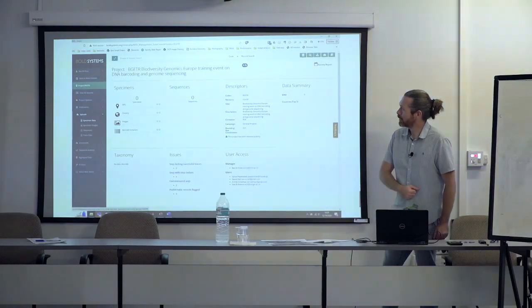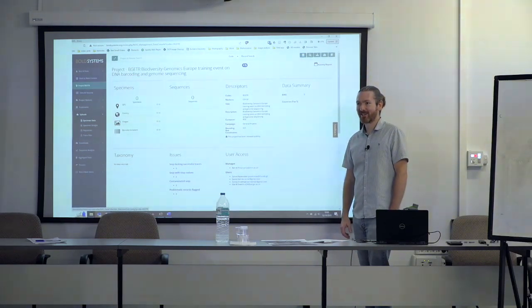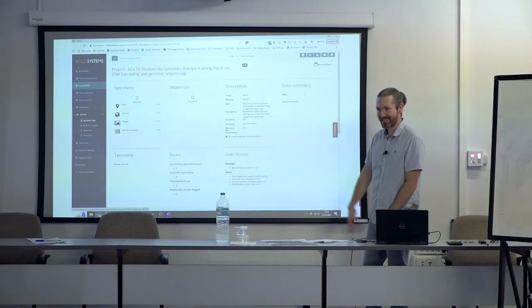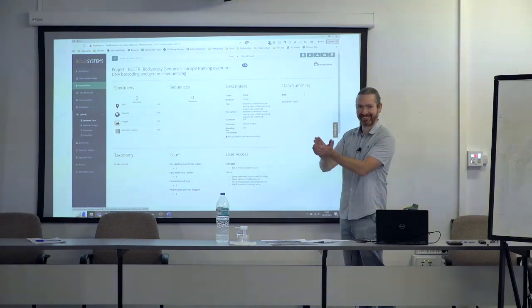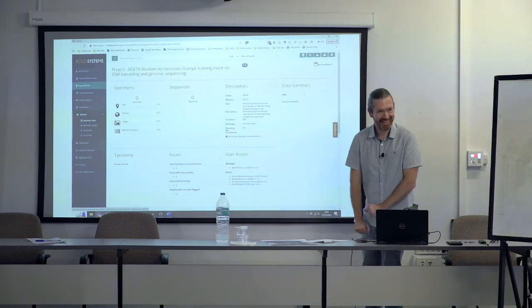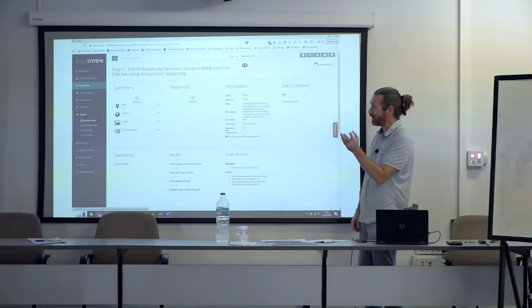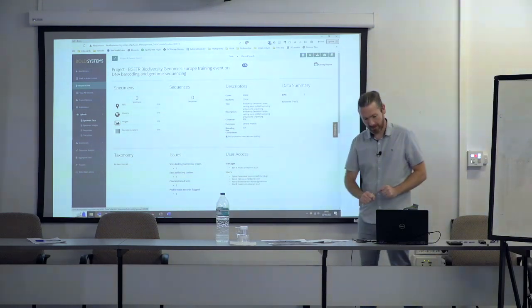Here is our project. And it says 0 specimens, but it actually now has 2, because I uploaded the 2 leeches from our Ukrainian colleagues this morning, but I didn't take a new snapshot. So it's got 2 specimens, and they both sequenced, and they both have species identifications. So that's great. So there'll be 2 and 2 over there in the near future.